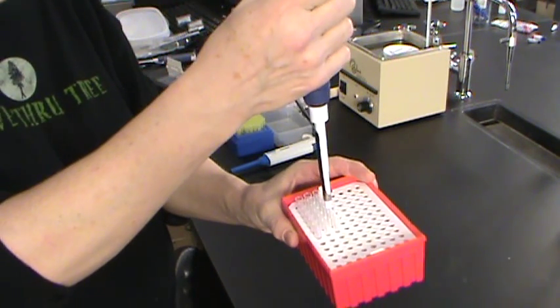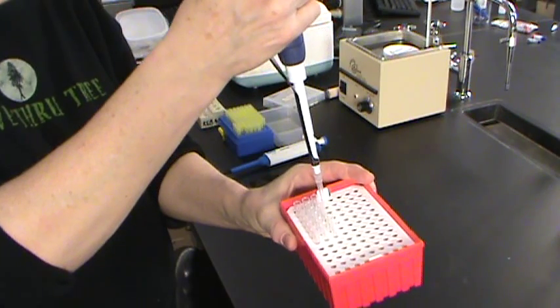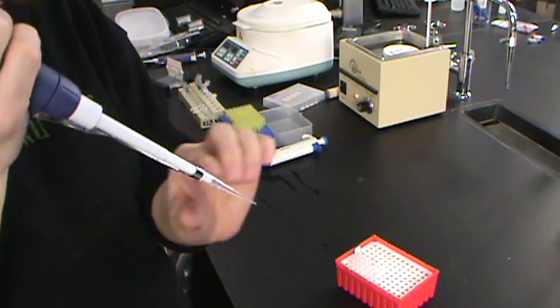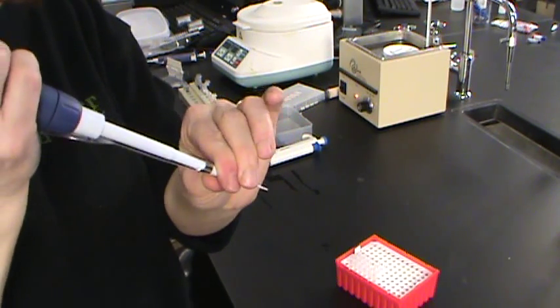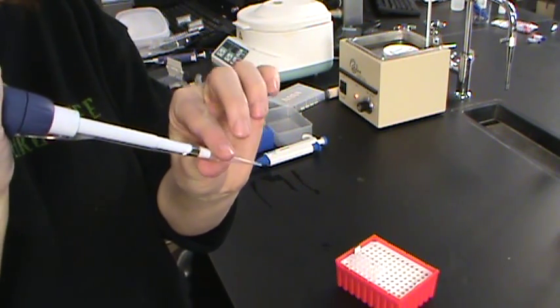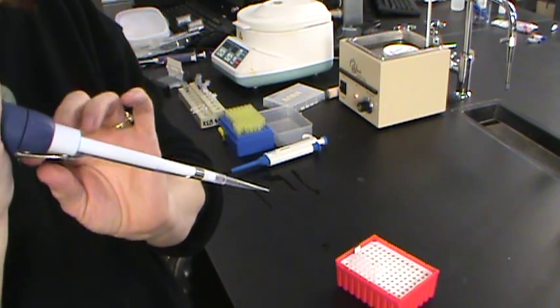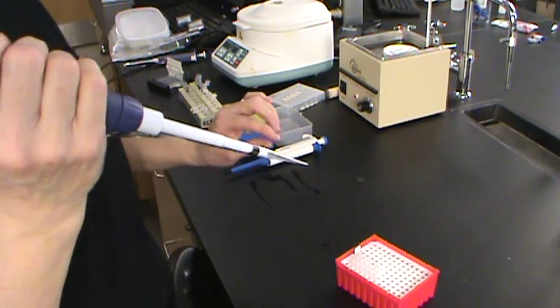What you'll want to do is gently put the pipetter into the tip in the box, but then you do want to make sure that it is firmly on the end by pushing it with your finger and giving it just a very slight turn. We don't want to break the barrel of the pipetter.